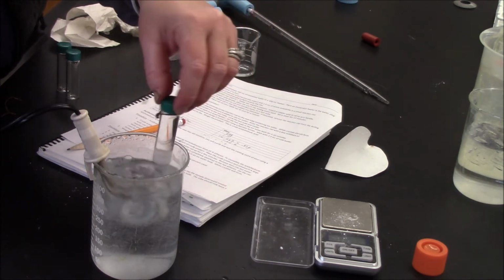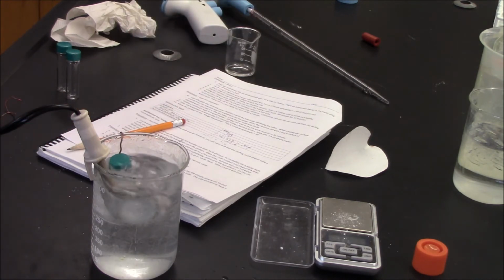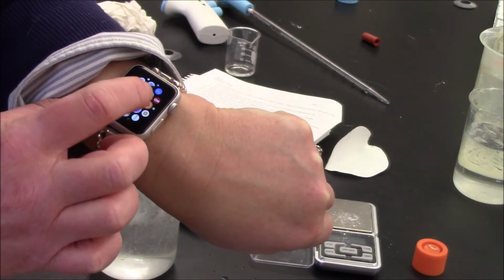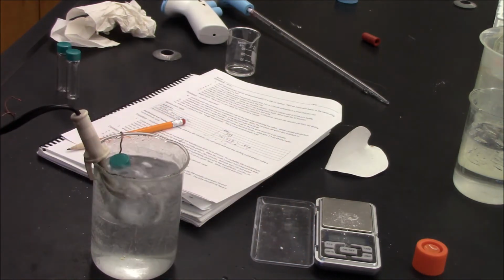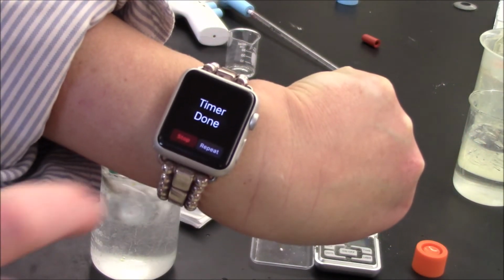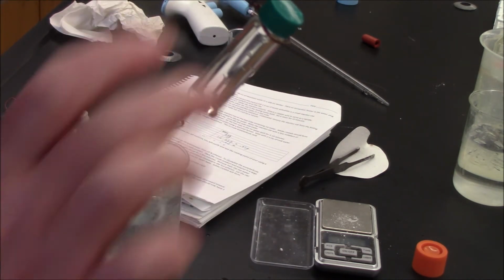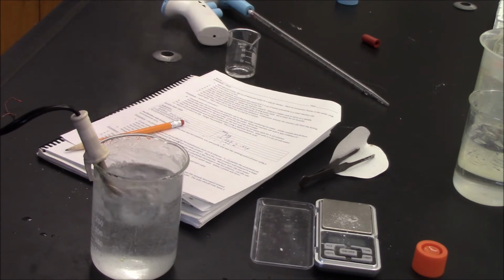Now that my copper wire handle is set up, I add it to the hot water bath, and I'll set a timer for a few minutes in order for it to heat up to the appropriate temperature. I'll see you in 3 minutes. My timer's going off, and I'm back. It's time for me to remove this from the hot water bath, and I find that it's quite hot. You can see that everything has dissolved. What I'd like to do is mix it thoroughly, but it's too hot to handle.